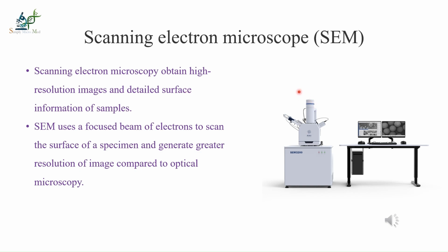And this is the picture of the scanning electron microscope. The scanning electron microscope is connected to a computer monitor with software. So whatever we are observing inside this scanning electron microscope can be visualized on the computer monitor.